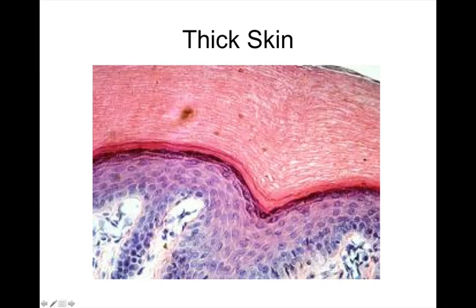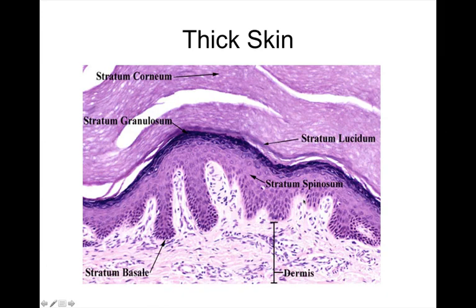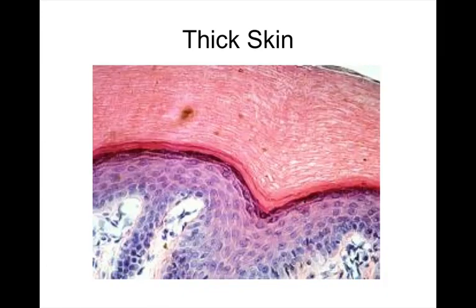So, what's consistent? Here it looks like the stratum lucidum is this pink color. That's weird. So weird. But again, this is blurry, but even comparing it to what we saw in this slide, you can see that the stratum basale, there's a real color change between the papillary layer of the dermis and where the epidermis starts. And then again, the stratum granulosum also picks up, those grains really pick up the dark stain. But here, once you get into the stratum corneum, those cells are really just flattened out. It's hard to even see the border. I mean, blurry, but still, really hard to see the borders.